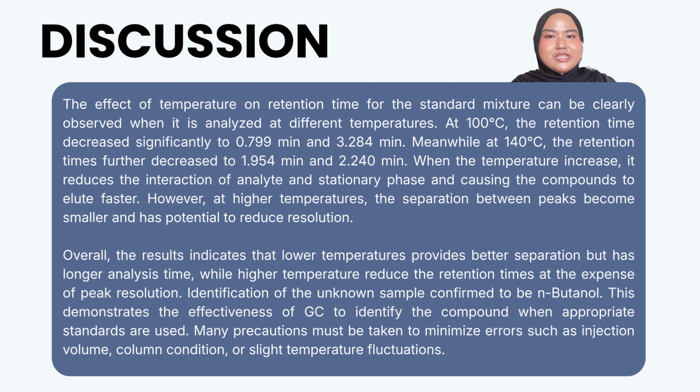The effect of temperature on retention time for the standard mixture can be clearly observed when it is analyzed at different temperatures. At 100 degrees, the retention time decreased significantly to 0.799 minutes and 3.284 minutes. Meanwhile, at 140 degrees, the retention times further decreased to 1.954 minutes and 2.240 minutes.